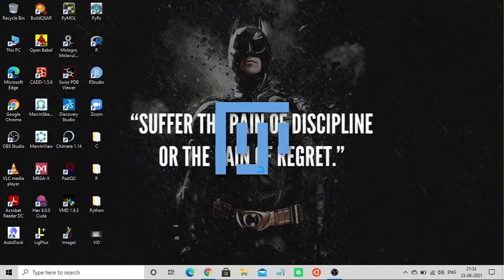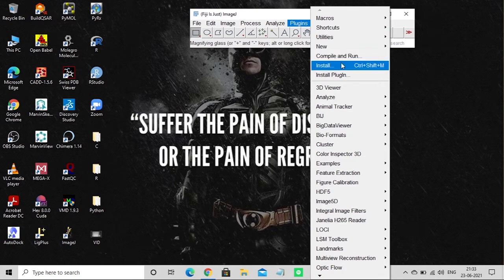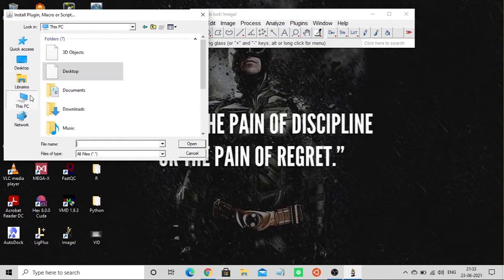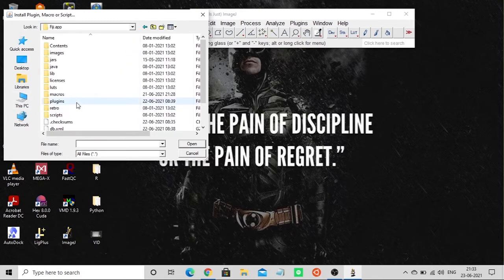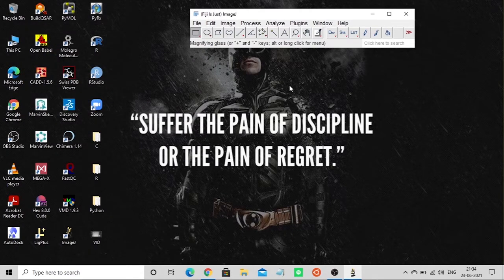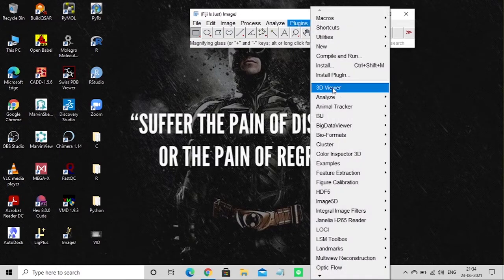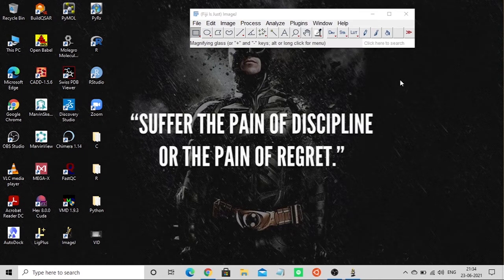Open ImageJ, go to Plugins, and click Install. Then navigate to the folder where Fiji is placed, go to the Plugins folder, and click on the file to install it. I've already installed it, so I'm not doing it again — there are many YouTube videos showing how to install plugins. I can see the Animal Tracker plugin here.